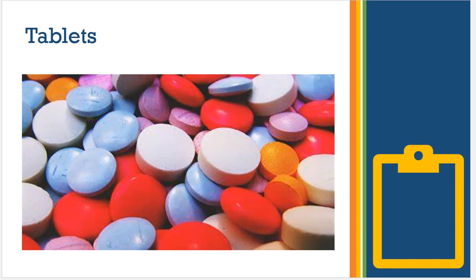There are very few times in between where there are capsules. There are capsules that are out there over the counter, but keep in mind these are dietary supplements, not prescription medications, not prescribed medications, dietary supplements only. So there are some dietary supplements that come in this form of a tablet, and you'll probably use some of these with maybe our melatonins that we're going to have you measure out, and so forth.